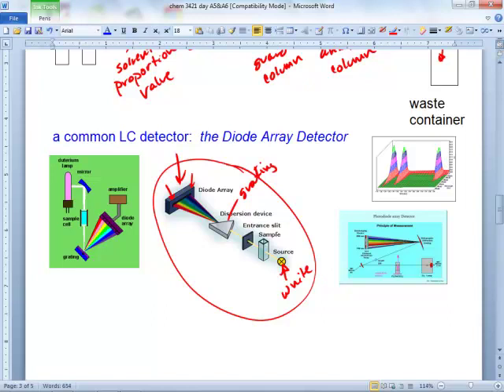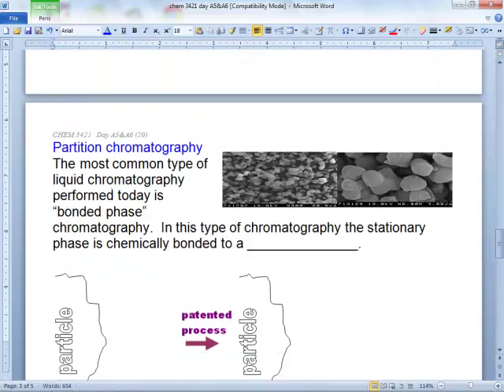It's really, really fast. You have a big, expensive UV-vis upstairs, and it's not like that. You have to scan one wavelength after the other. So there's real advantages to a diode array detector. But that's a very common one. Okay.